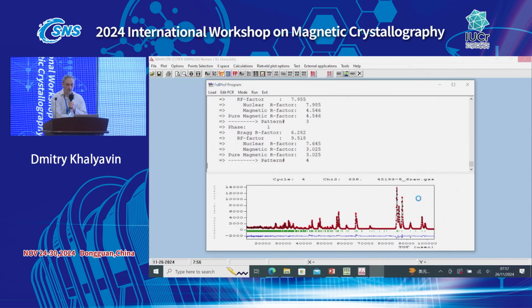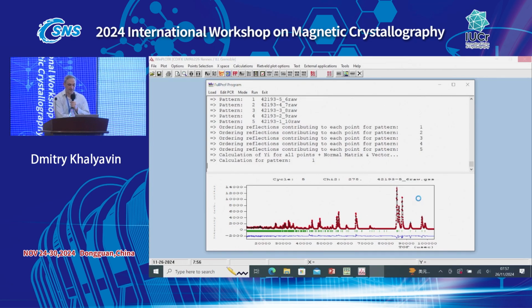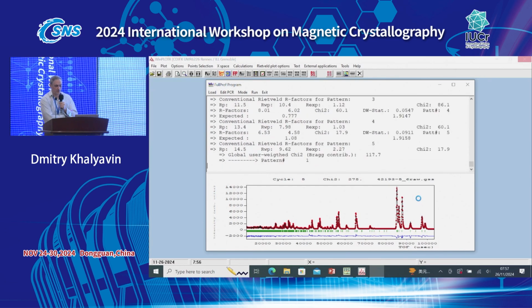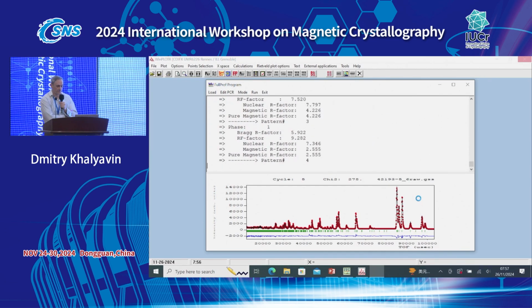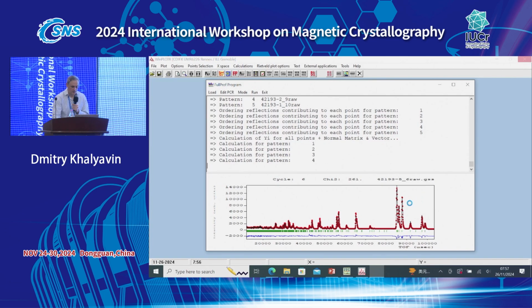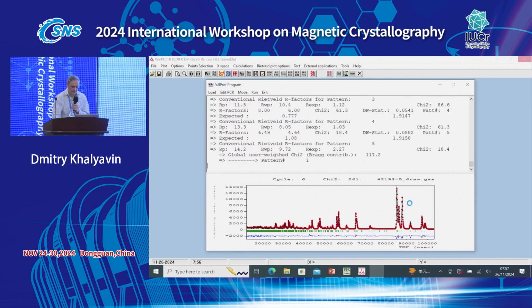So, as I said, you can just vary some of them. Let's say on the X component or Y component, and try Y by one. Okay, so it's good. Let's have a look at what we have when it's finished.